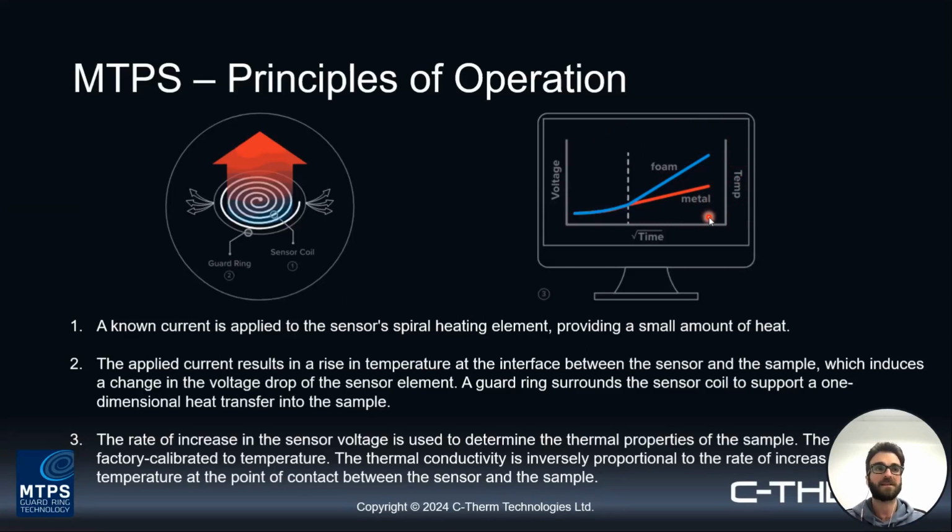And the nice thing with the MTPS is that it's a calibrated technique. So all of the data analysis and really all of the parameters that are used for setting up the measurement are handled automatically by the software. I'll leave it there, but if you wanted to go into this in further detail, I'm definitely happy to go into more of a one-on-one discussion with you folks if this is something you're interested in pursuing.